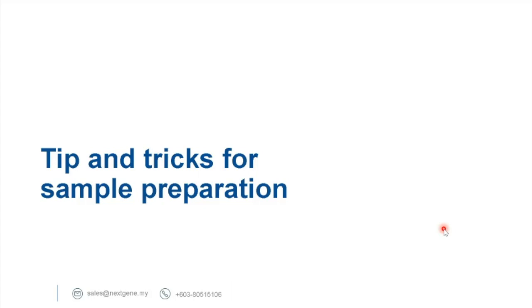No. My understanding is because you are sending a single-stranded template, am I correct? That's the reason why you can only have one sequencing event when you have a single-stranded template. But we gave 2 types of different primers.